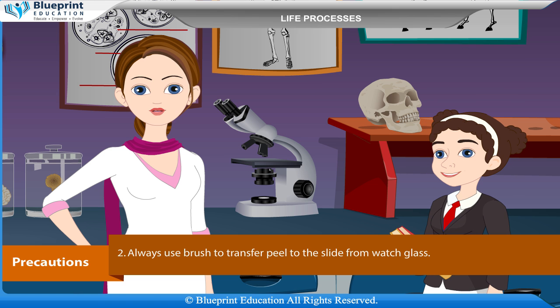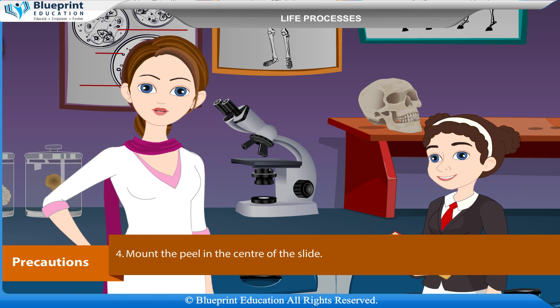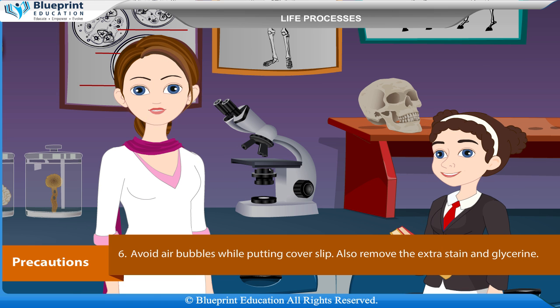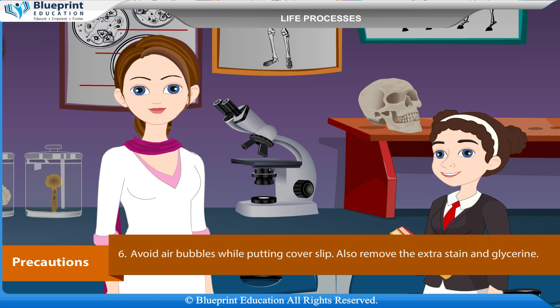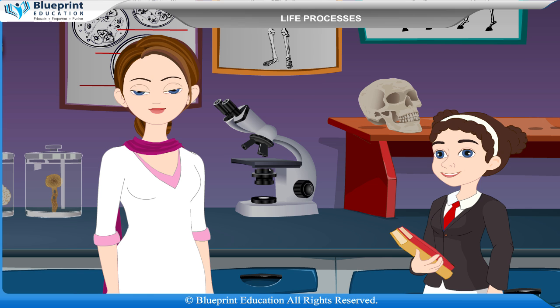Precautions: A freshly plucked leaf should be used. Always use a brush to transfer the peel to the slide from the watch glass. Never fold the peel and do not allow it to dry. Mount the peel in the center of the slide. The peel should not be overstained. Avoid air bubbles while putting the cover slip. Also remove the extra stain and glycerine. Do not breathe over the peel.